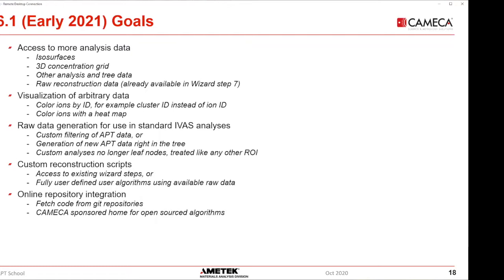Is it STL? Yeah, I think STL sounds right. So like an industry standard format, as opposed to having to extract the isosurface data from VRML. I think that's what people have been doing in the past. Yeah, either that, or we wrote a script to get it out using the JSON interface. Okay, yeah.